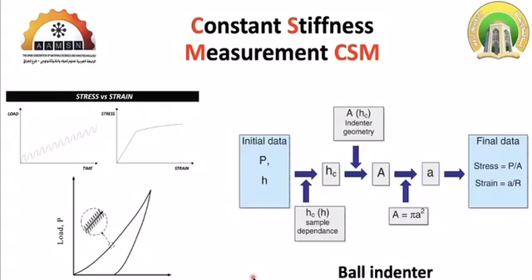The idea in nanoindentation is that everything is controllable, and we can apply different load functions on the indenter to extract different mechanical properties. We will go through the important load functions used in nanoindentation and the mechanical properties that we can extract from them.